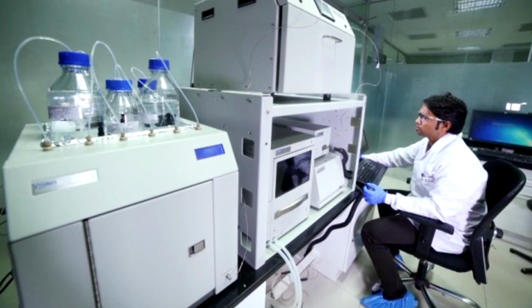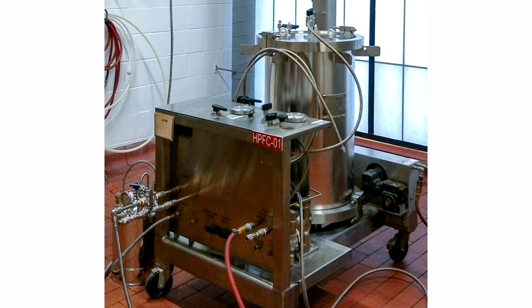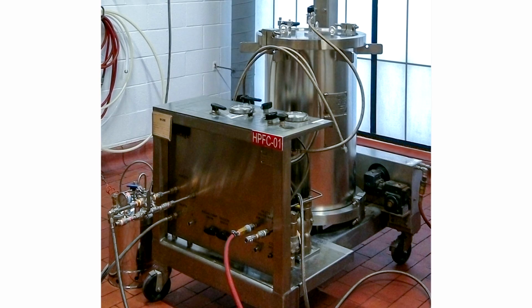The next step in chromatography development involves looking at different mobile phases or solvents that can separate the impurities from the target compound. This is followed by some small-scale column chromatography, where you might look at improving the yield, increasing the column loading, or reducing the amount of solvent that's required to elute the target product.